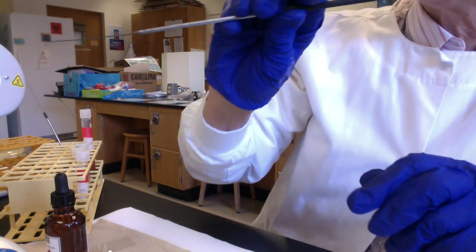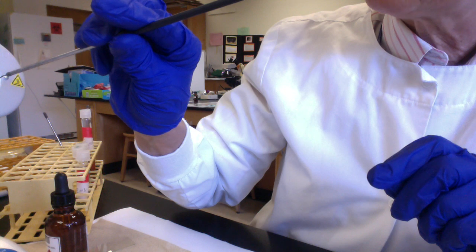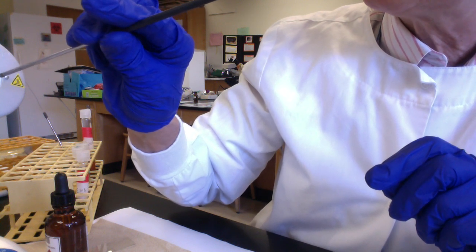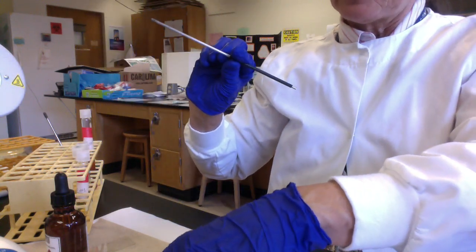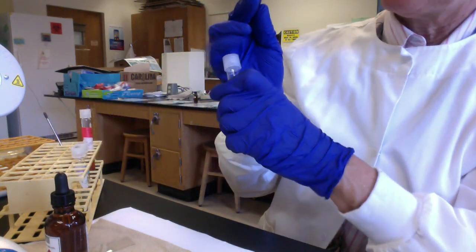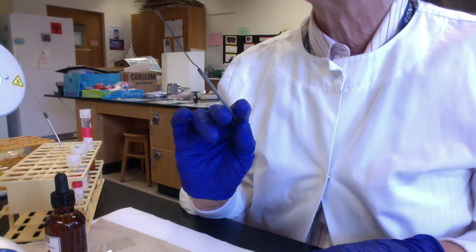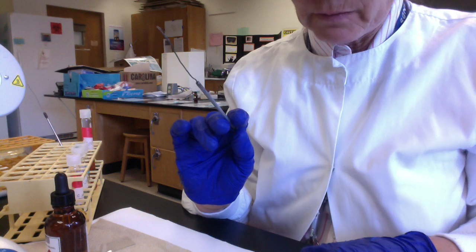Okay. All right. So now we're going to go back and we're going to continue with our IMViC tests. So we're going to continue with the MViC test. So I is for indole, M of MViC is for methyl red, and methyl red is a test to determine if your microbe uses a specific fermentation pathway called mixed acid fermentation. And mixed acid fermentation, as the name suggests, you get lots and lots of different acids made at the end of the fermentation pathway. And because you get all these acids made, the pH is going to be really low, like below pH 4.4, 4.5.